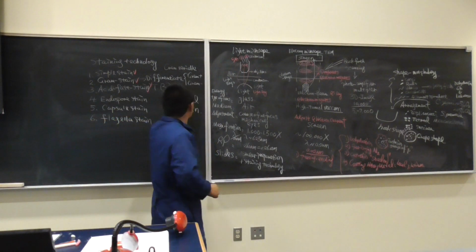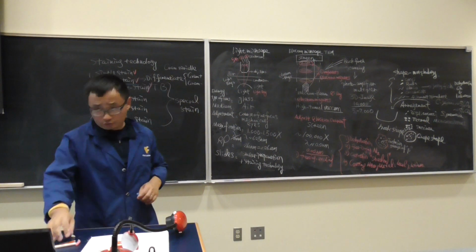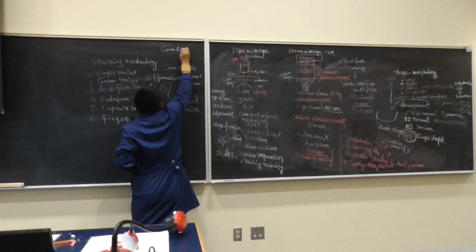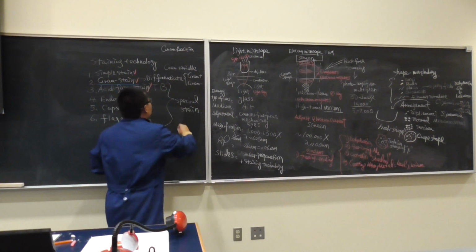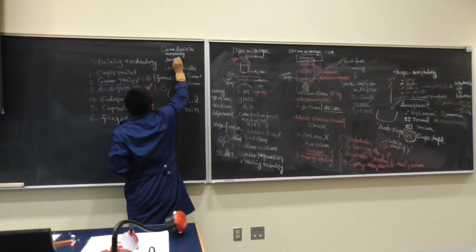Therefore, I always make sure you understand that for the gram stain, there are 3 major items you have to record. It is gram reaction, which everybody knows, positive or negative. But you may forget to describe morphology. And the more important one is arrangement.